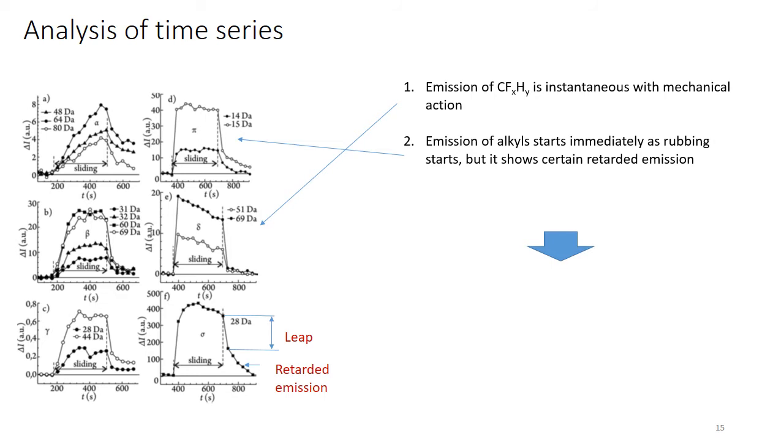I mean, the system means the surface and the ionic liquid, and then these changes still produce the emission, and this emission can be due to desorption, can be due to diffusion, or due to relaxation of some active species which contribute to the generation of these gases.